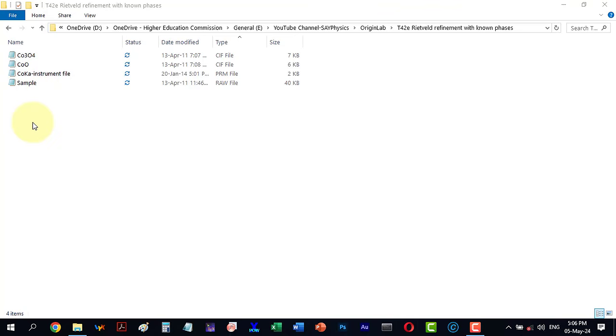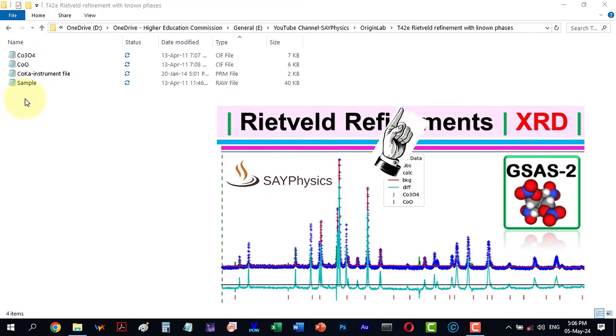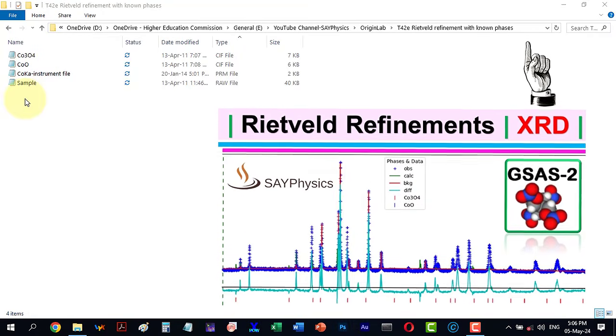In this video, we will discuss how to perform Rietveld refinement with known phases using XRD data. If you are interested in learning about the various aspects of Rietveld refinement and associated terminologies, I have already recorded an introductory video which you can find in the link above.